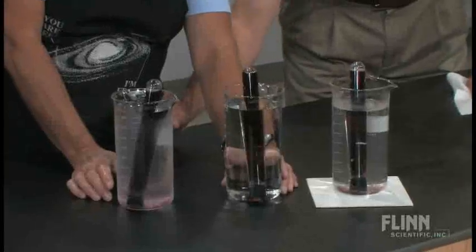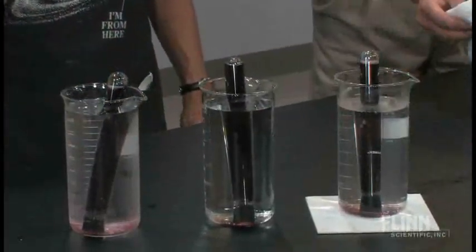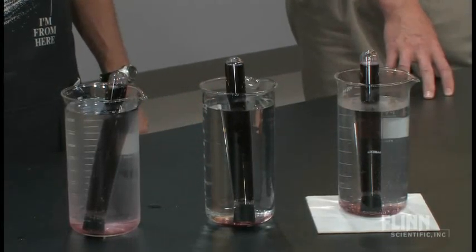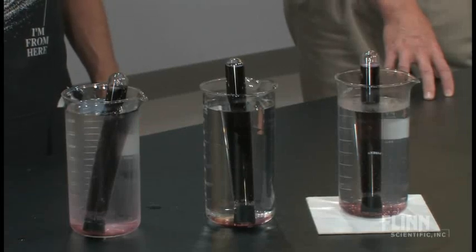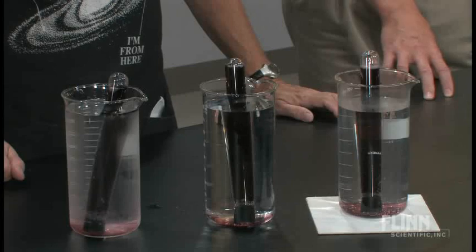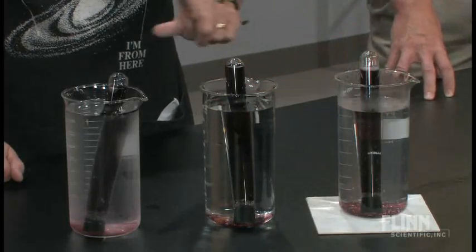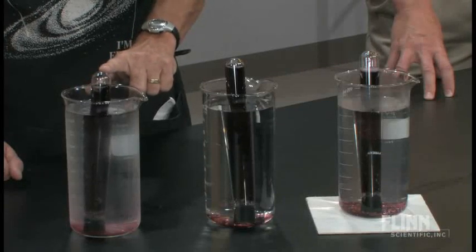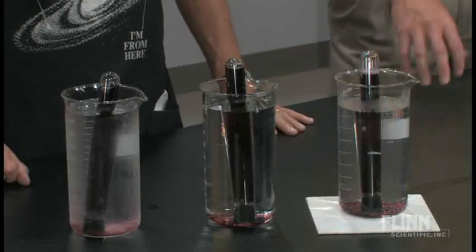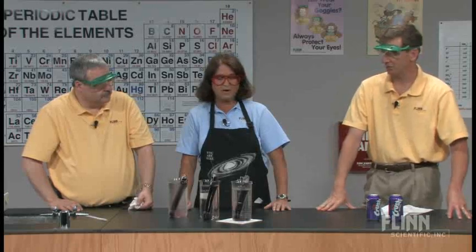We want to make our observations. One of the first things you'd notice is going to be at the top of the test tubes. One thing you want to make sure of when you fill the test tubes is that when you put the stopper in, the liquid overflows so you don't have a container of gas at the top to begin with.